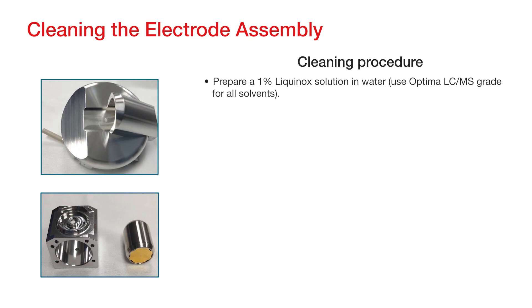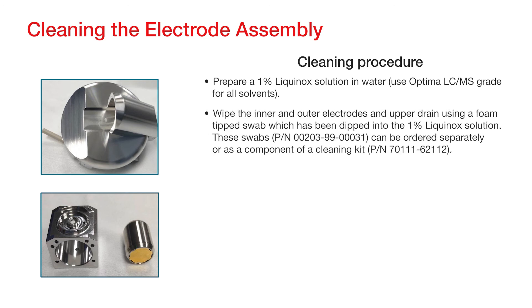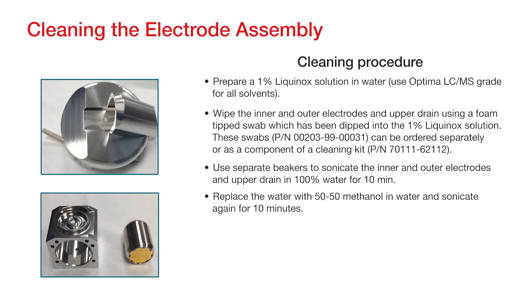Prepare a 1% Liquinox solution in water. Wipe the inner and outer electrodes and upper drain using a foam-tipped swab, which has been dipped in the 1% Liquinox solution. These swabs can be ordered separately or as a component of a cleaning kit. Use separate beakers to sonicate the inner and outer electrodes and upper drain in 100% water for 10 minutes. Replace the water with 50-50 methanol and water and sonicate again for 10 minutes.